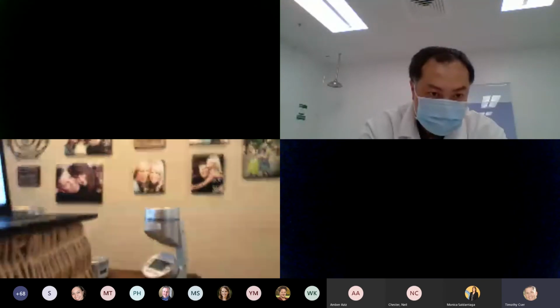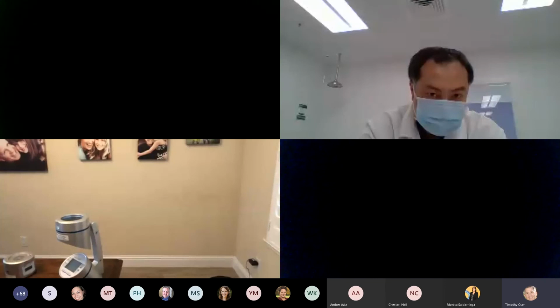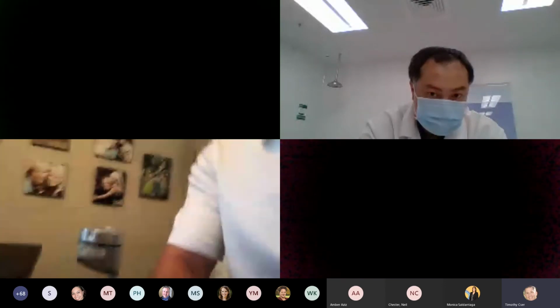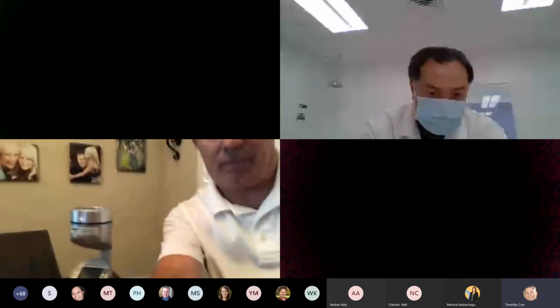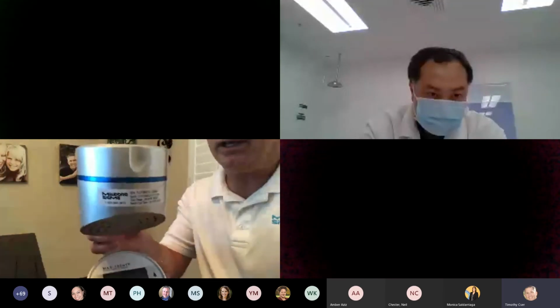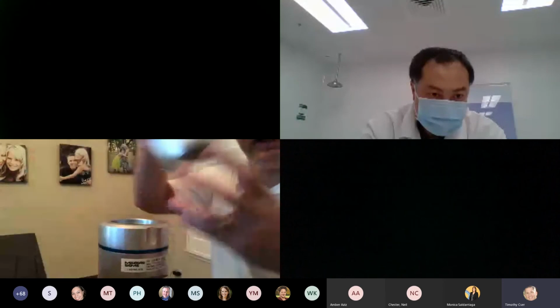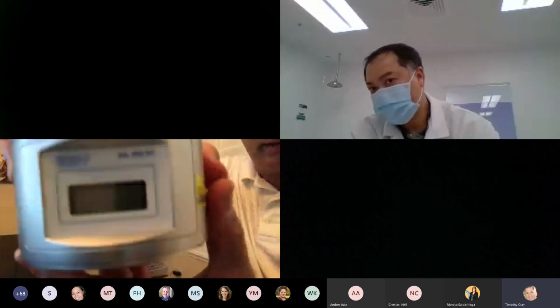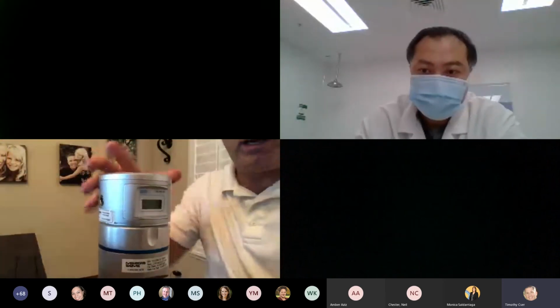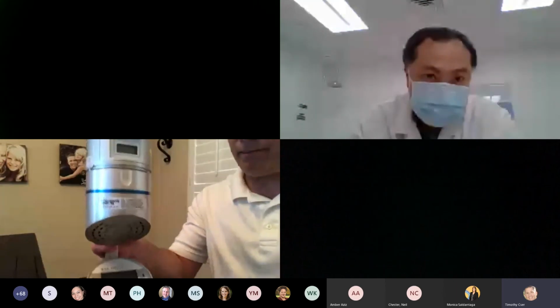All right, let me set this down. I'm going to switch it around again. Great. Okay. So we have here the MAS 100 NT, and everyone can see that. And we have here the Da100 NT. Okay. So this simply fits right on top. No problem, just right on top.